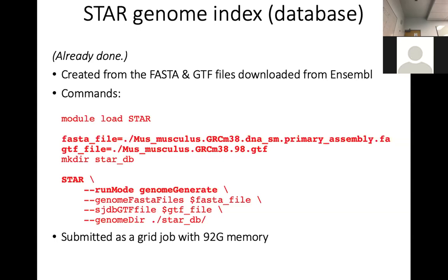This is where my directory is supposed to be. And this is where the database is, and you just take the full STAR and also change the genome index, it's just where it is. Same thing for each of the different STAR runs.